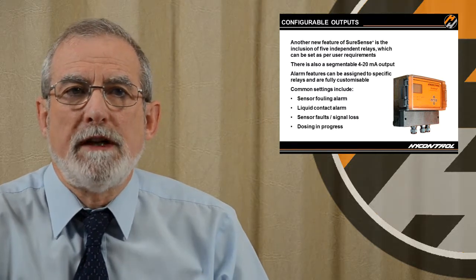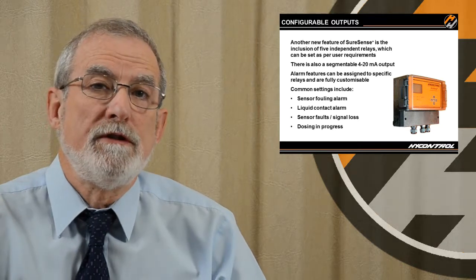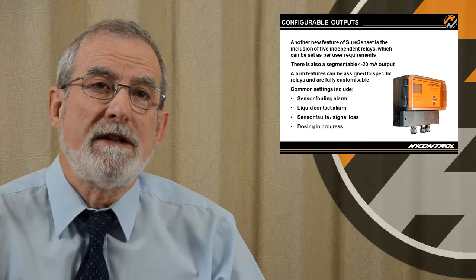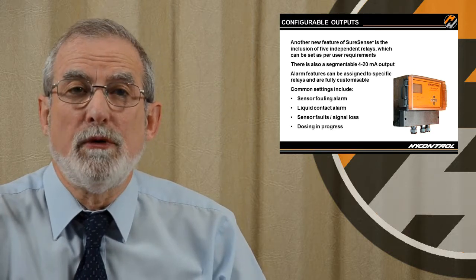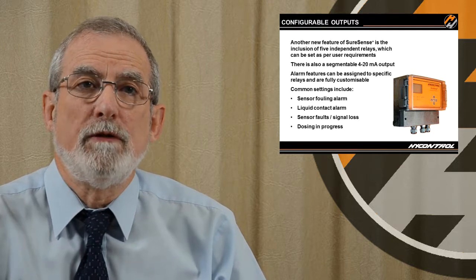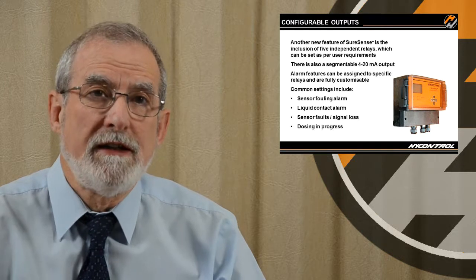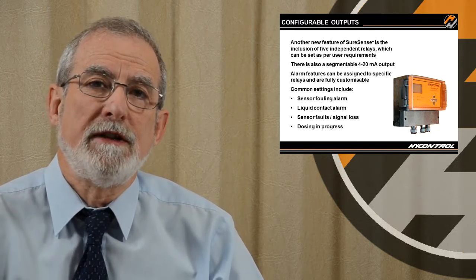If the probe is measuring liquid rather than foam, we might want to know that. We might want to use it to control a liquid level. We might want to use it to indicate that the process has gone out of control or reached a certain point. And we can configure one of the alarms to indicate that one of the measurement points or any of the measurement points is measuring liquid.